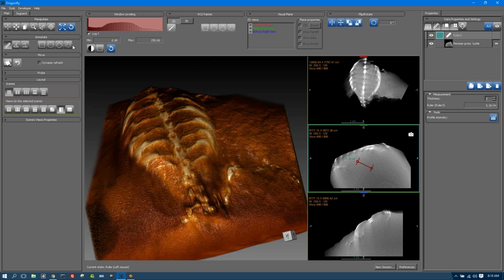We know there are a lot of applications in comparative anatomy where you may want to do landmark analysis. If that's something you're interested in, I'd like to have some feedback from you, because that would be very easy for us to add a plugin, or support a user who wants to add a plugin, for making that application accessible, where maybe you have templates or libraries of landmarks and you want to place the reference landmarks on your experimental specimen so that you can do your morphometric analysis downstream. We don't have anything like that, but it would be very trivial for us to extend that. So if that interests you, please send me an email offline, and we'll continue that discussion.